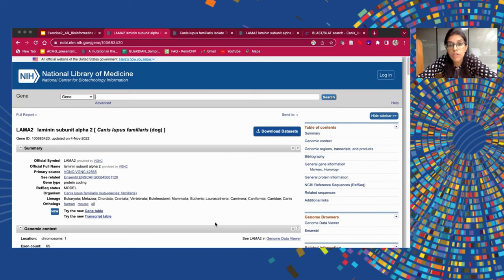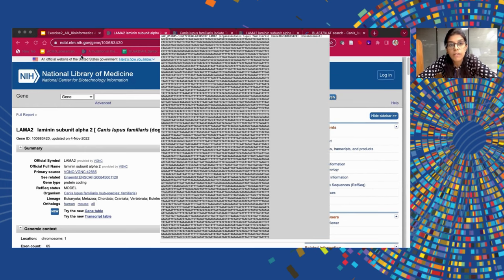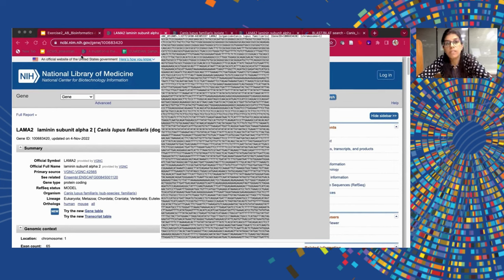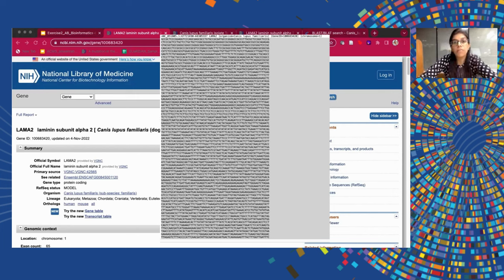Now let us look at the gene FASTA sequence, which I have already downloaded. This is the LAMA2 gene FASTA sequence. What we can do is select a particular section from this gene itself and assume that this is our given DNA sequence. The third scenario could be that you have just been given a random DNA sequence and you now want to map it back and find out which gene it is.